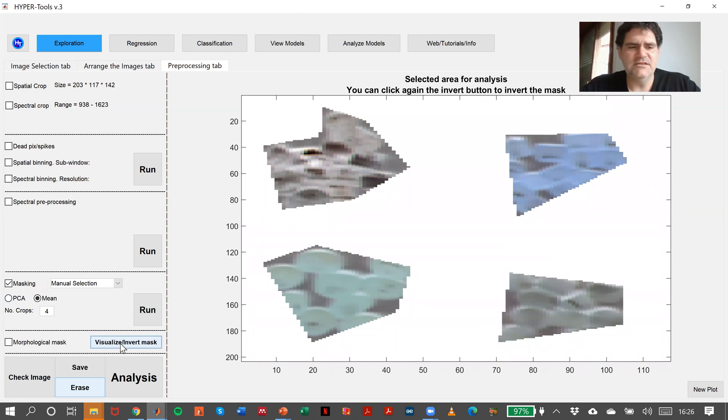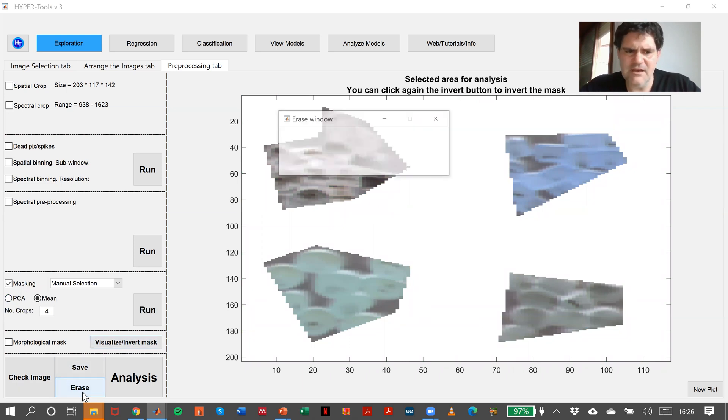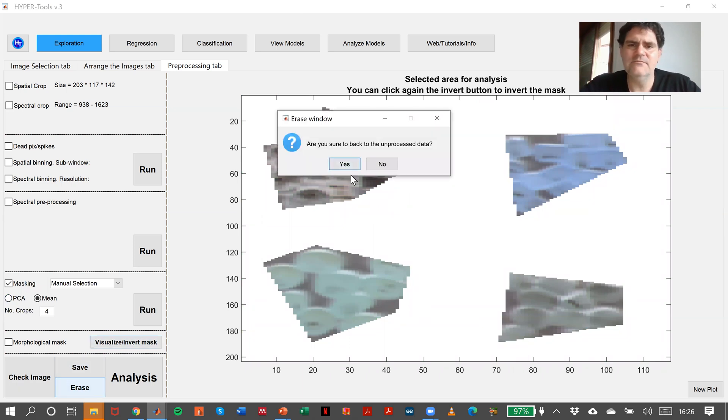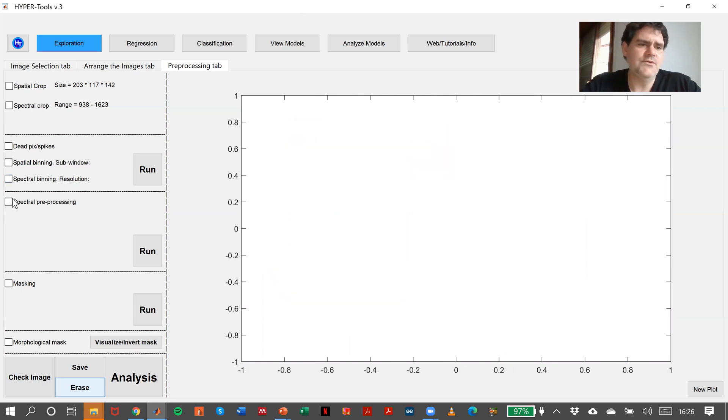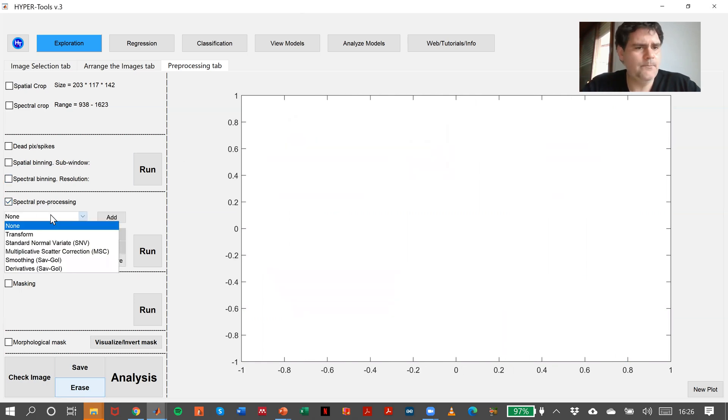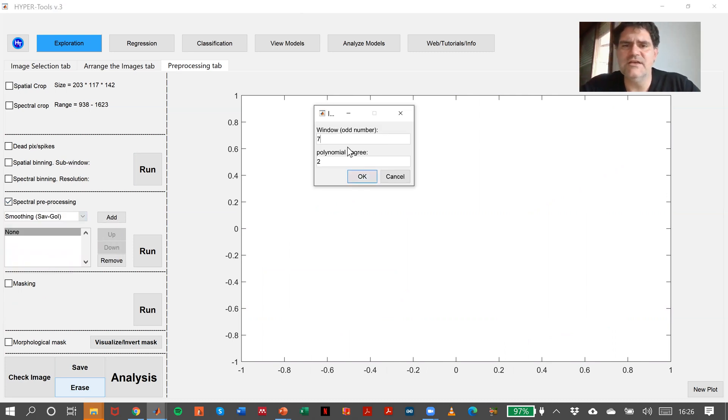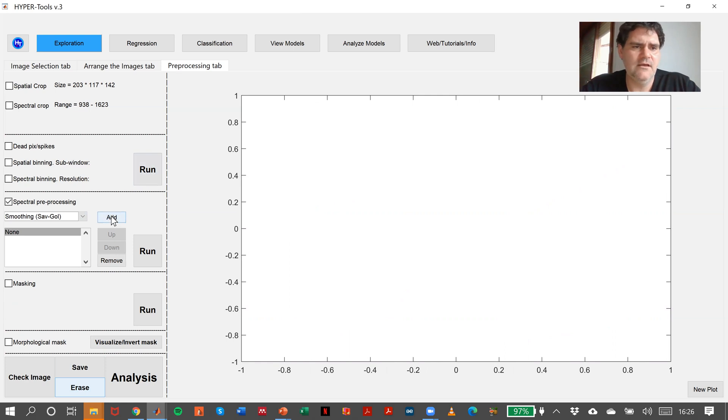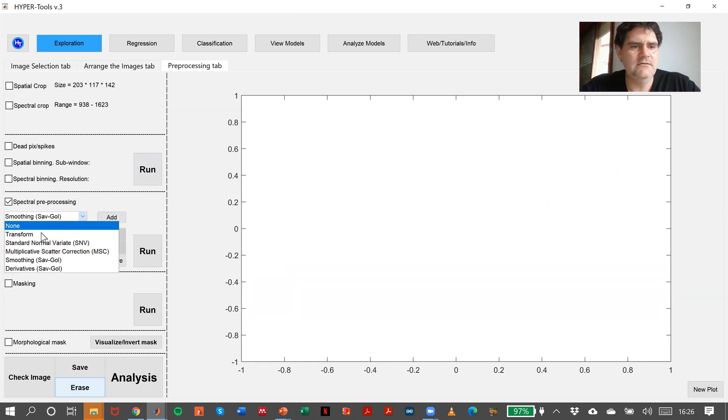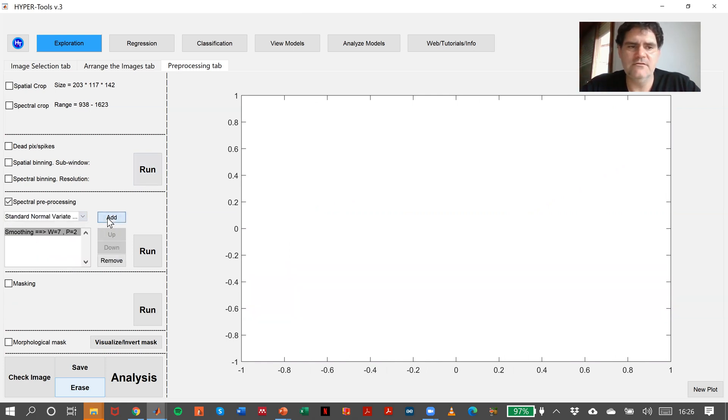We have the part of the image that we need to analyze. In this case, what I would do, I would say erase again. I will repeat spectral preprocessing, smoothing instead of 15, that is a little bit high, I would say seven. Add. And the standard normal variate, add.